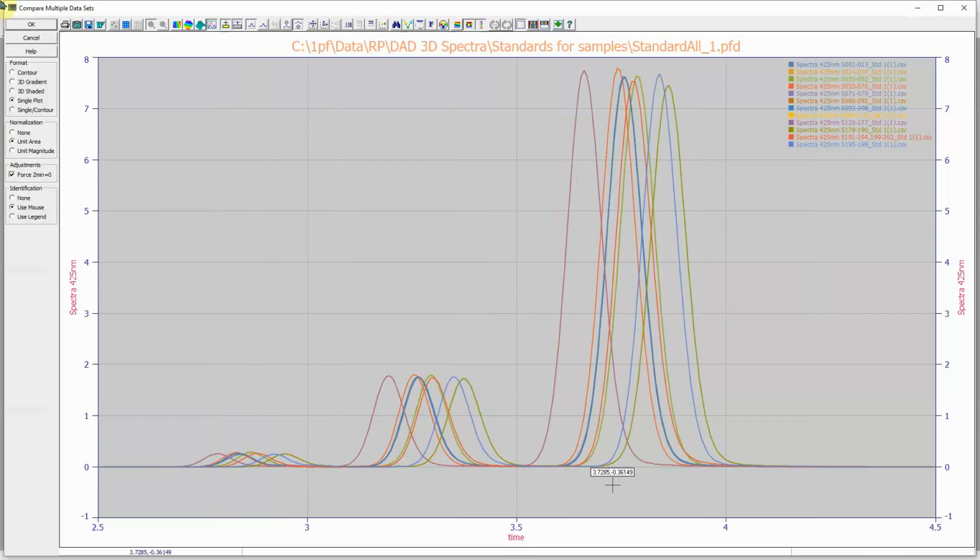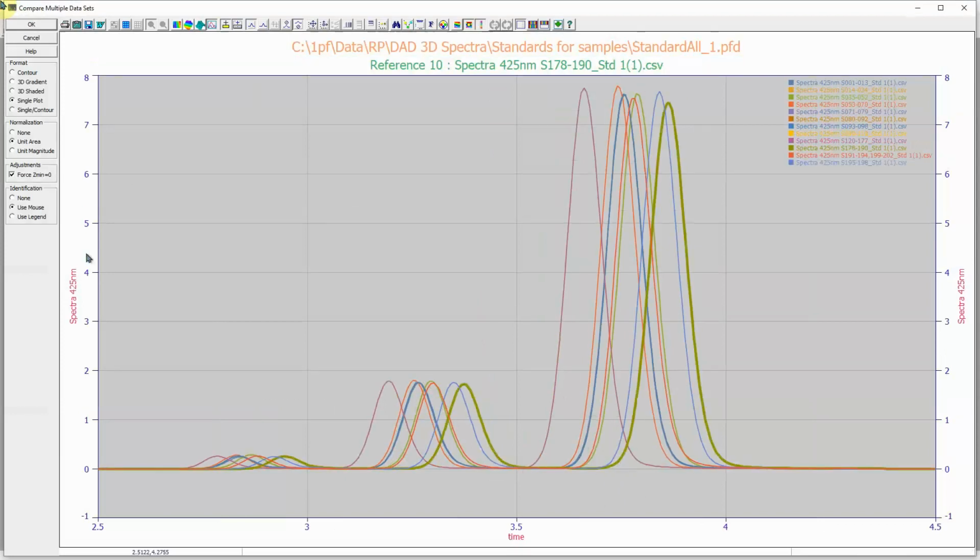As you will note, the areas of the 3 components of this standard are approximately equal across the different runs across time, but the elutions varied somewhat. We might thus expect some variation in the estimate of an IRF as a consequence.